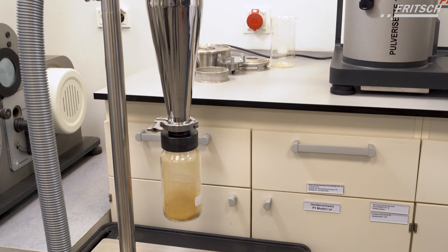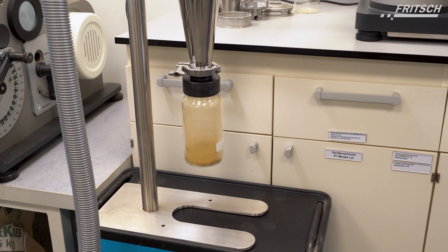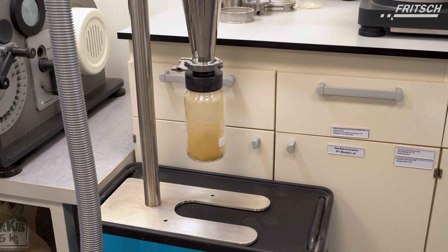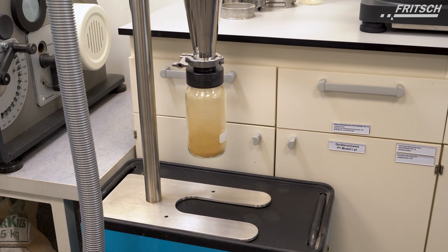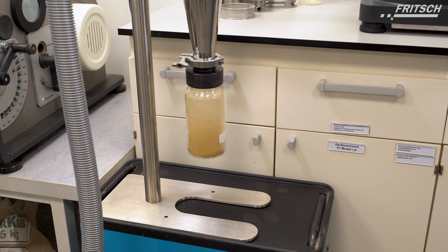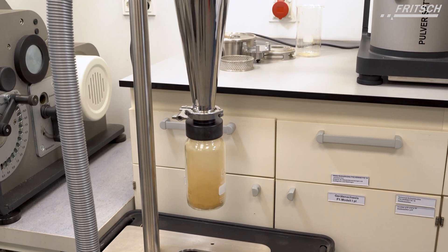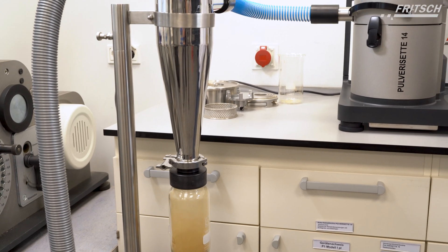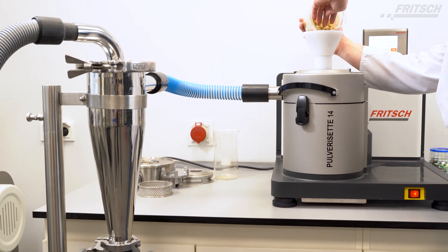The FRITSCH high-performance cyclone separator, completely made of stainless steel, is particularly indispensable in the analytical sector and in the food and pharmaceutical industries. Due to its high surface quality, it offers enhanced resistance to corrosive media such as alkalis and acids, and is especially easy to clean with a wide range of possible cleaning agents, without leaving any residues.